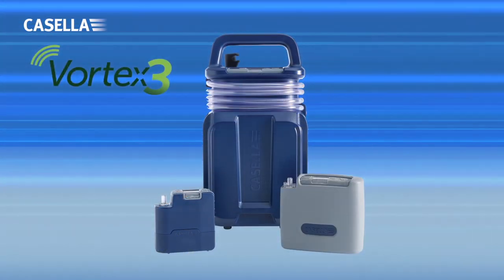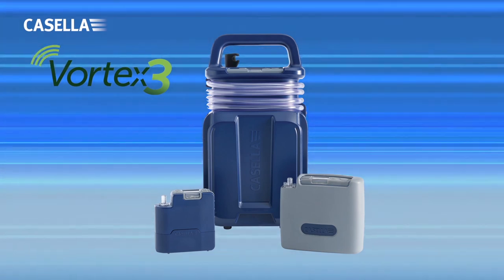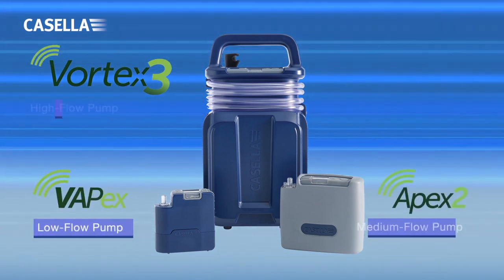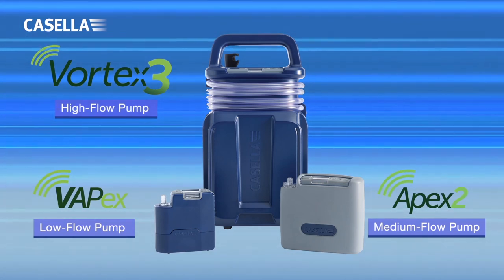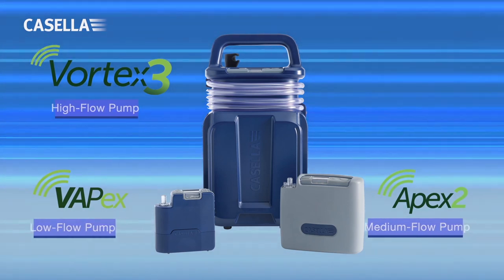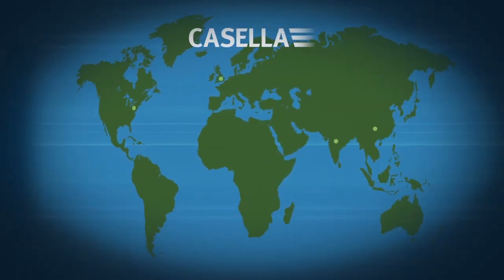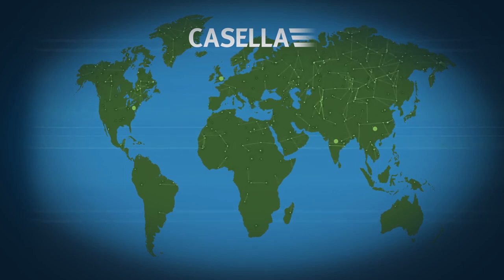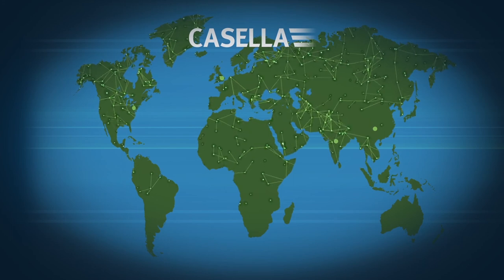With the introduction of the Vortex 3 to the Casella range, we can now offer you air sampling capability at low, medium and high flow rates, all with the same market leading performance you have come to expect from us. With international offices in the US, India and China, as well as a network of global distributors, Casella can provide the support you need wherever you are.